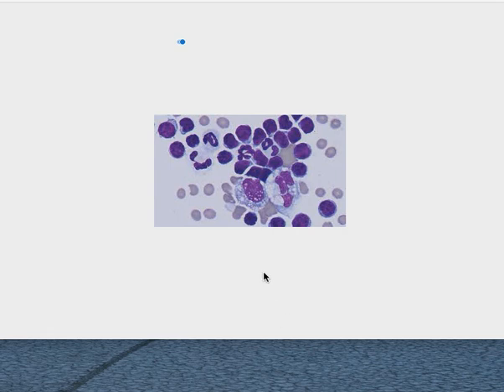If this was my cytology from my unspun effusion, I probably would not spin down the rest of the fluid and make a sediment because it's pretty cellular. And remember, guys, we don't care about red blood cells now that we're into cytology. We care about nucleated cells. So if you have a whole picture here of red blood cells with one lymphocyte, that is not a cellular sample.